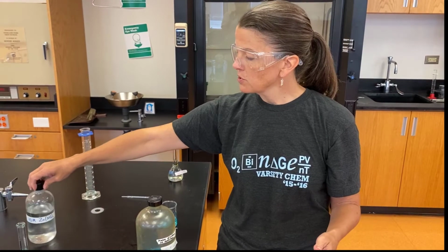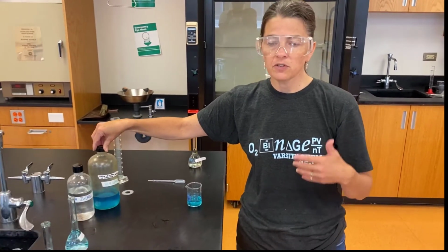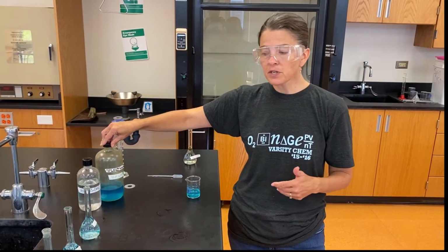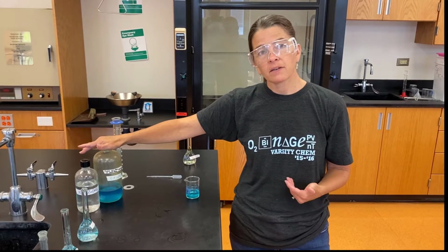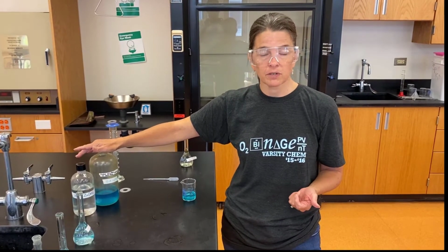So we're going to use a tool called a SpectraVis, and it uses light to detect absorption. Things with color can absorb light. So we're going to work with our copper, which clearly has color, and we're going to see how much light it absorbs, and hopefully that will be able to tell us the concentration of the copper nitrate in our solution.